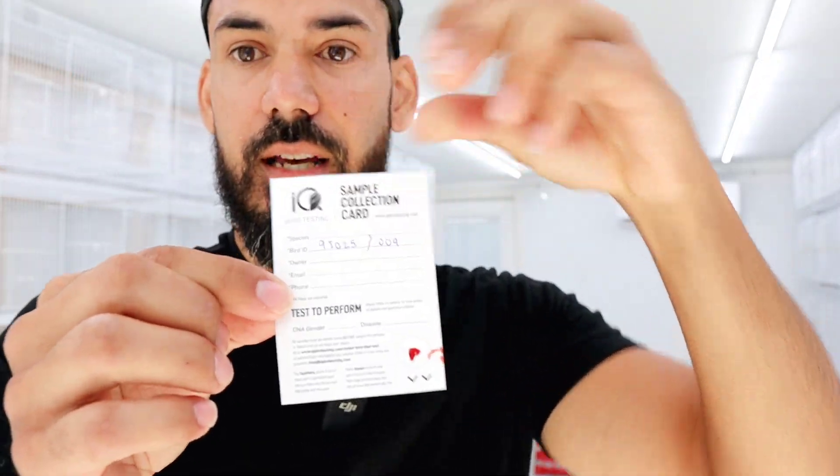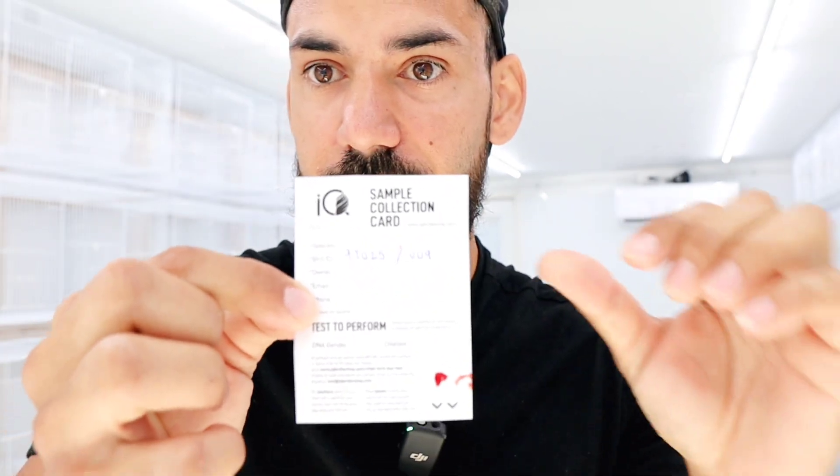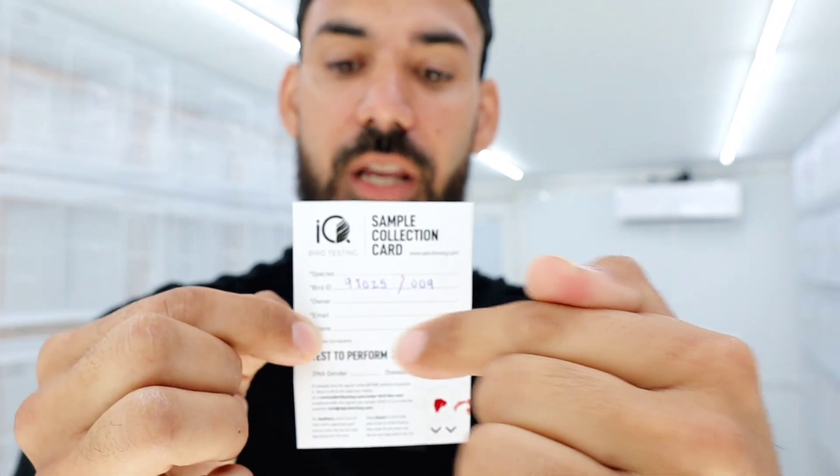This is what it looks like — all you need is two to three drops in the little circle in the center of the card. Then you put the bird ID, the band number, and whatever is needed to identify it. There are a couple of other things to fill out: the species, the owner, your email and phone number. This is what you send out to get them DNA sexed. Once fully filled out, stick it inside a Ziploc bag. Let's go ahead and disinfect the clippers and do the other bird as well.